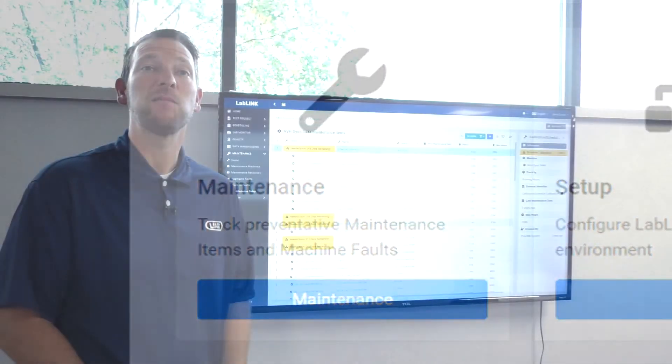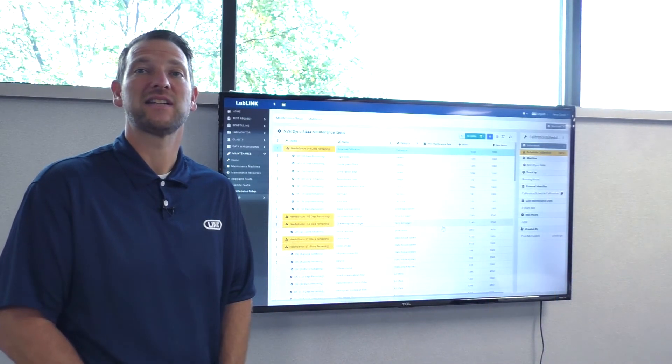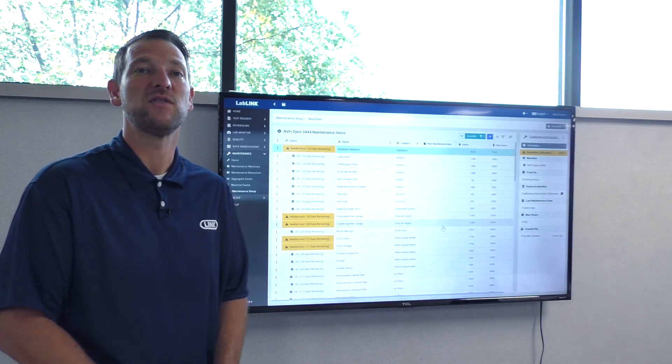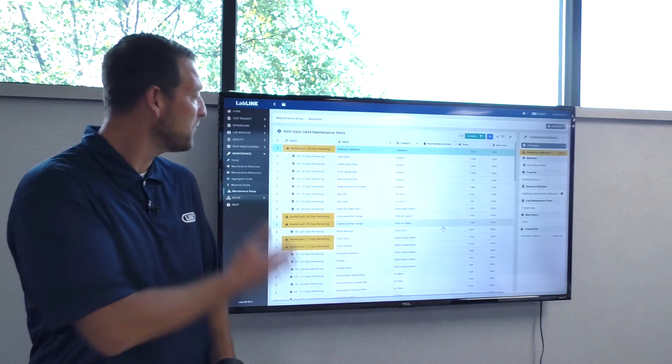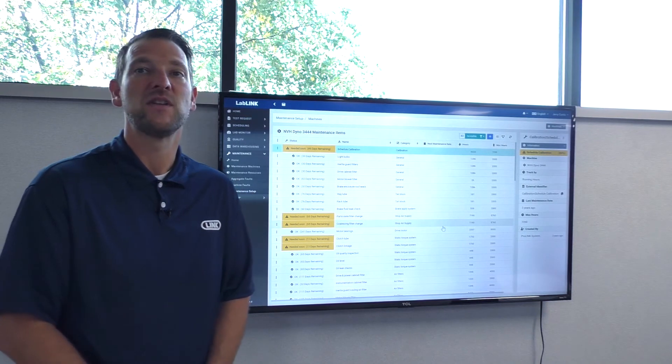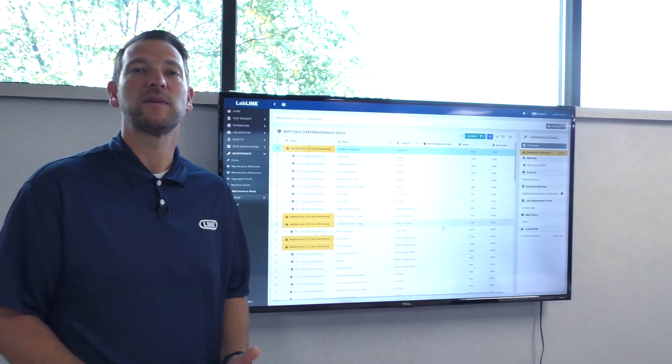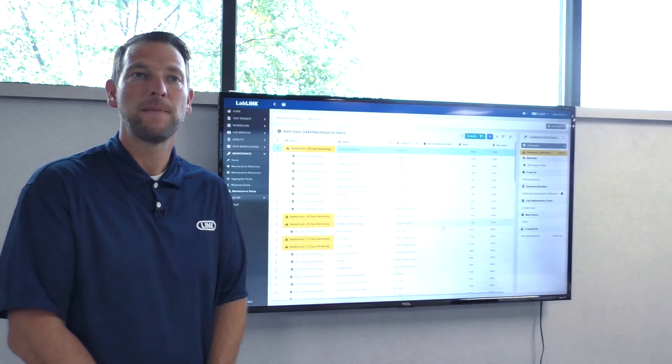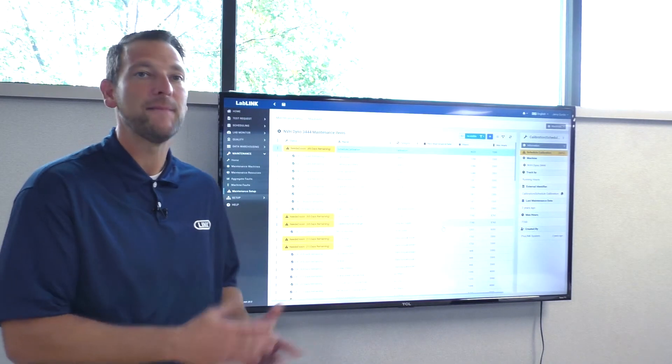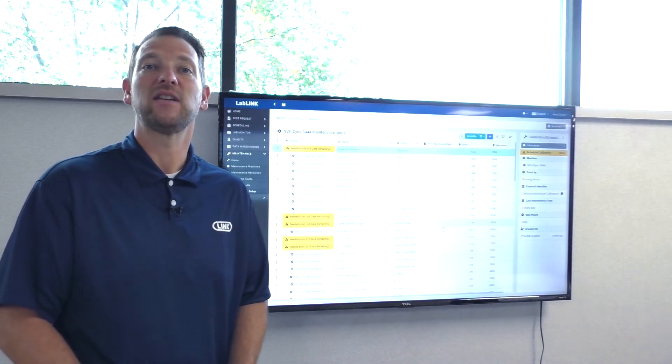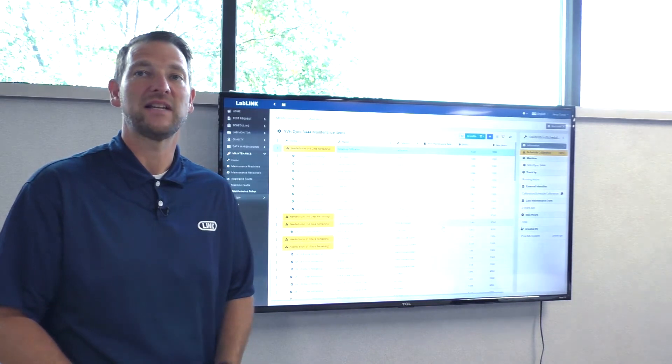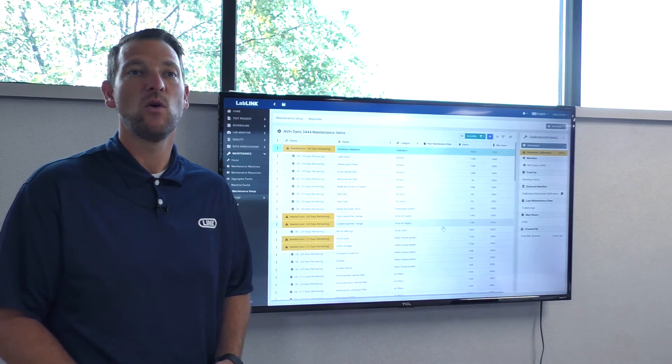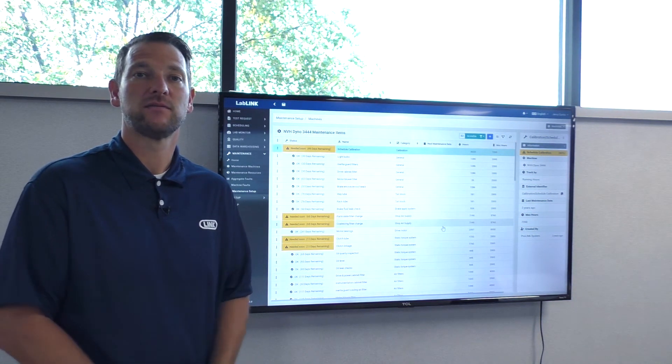Utilizing the maintenance module allows service technicians to have a single point of reference to view all of the machines that are in the laboratory that are due for maintenance. Managers can quickly determine which machines need maintenance and they can schedule those on the spot. Maintenance alerts can be configured based on actual equipment runtime or even at specific calendar intervals.